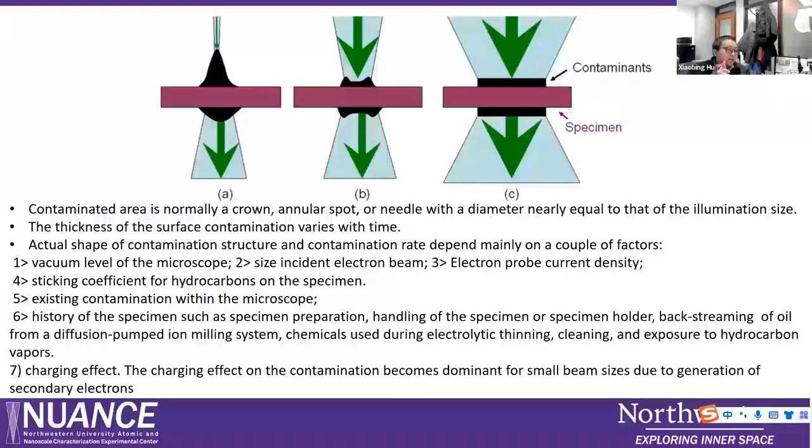Another thing is contamination rate related to the charging effect. The charging effect will become a dominant factor for small beam size because the charging will generate many secondary electrons. So that's why for different users, for different duration, different impairment, you will see that the contamination is totally different.